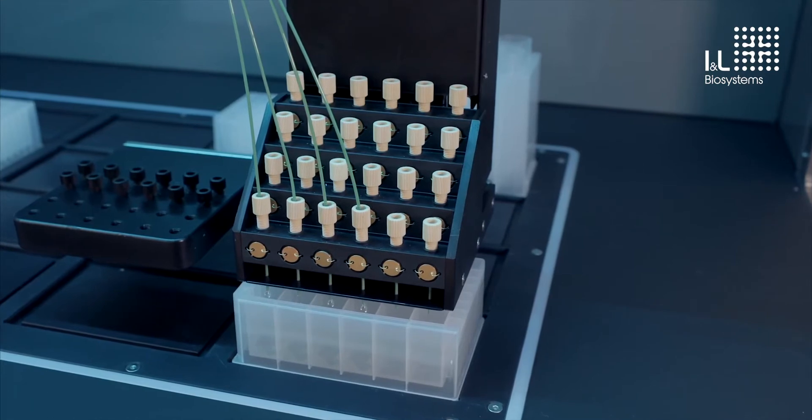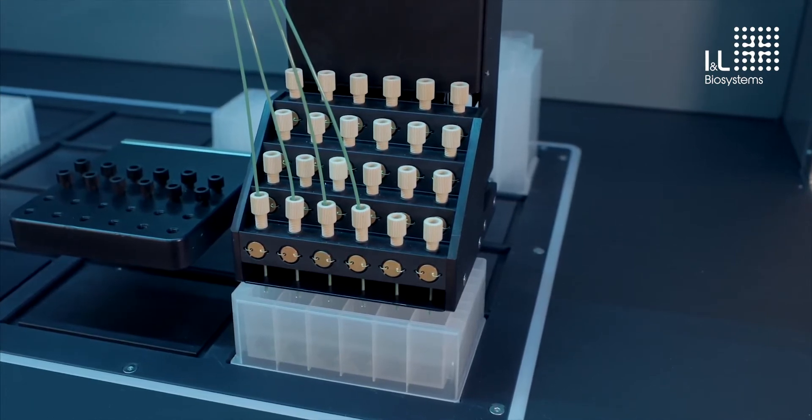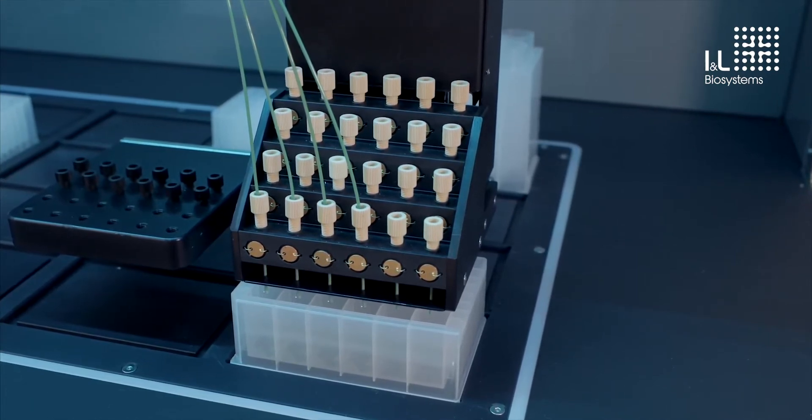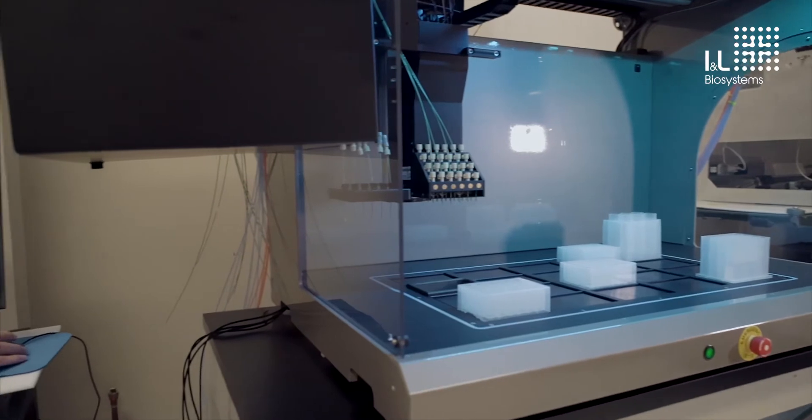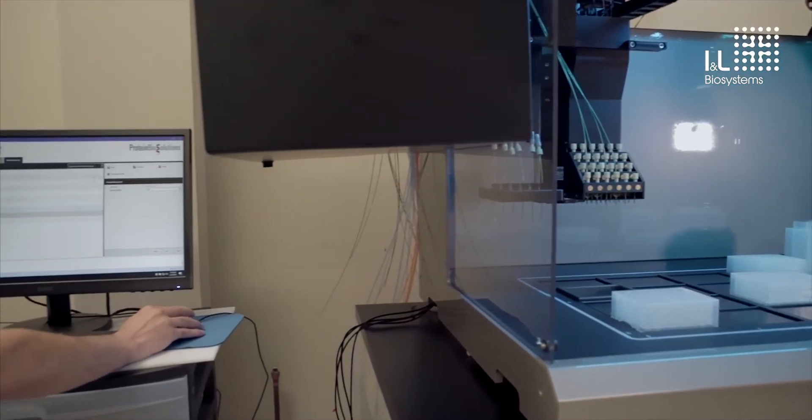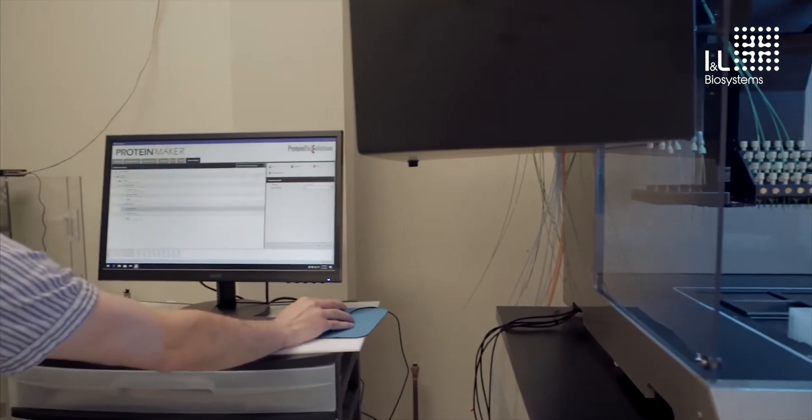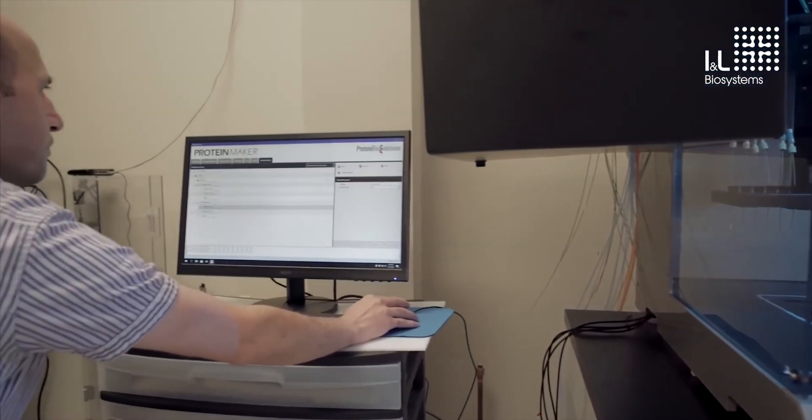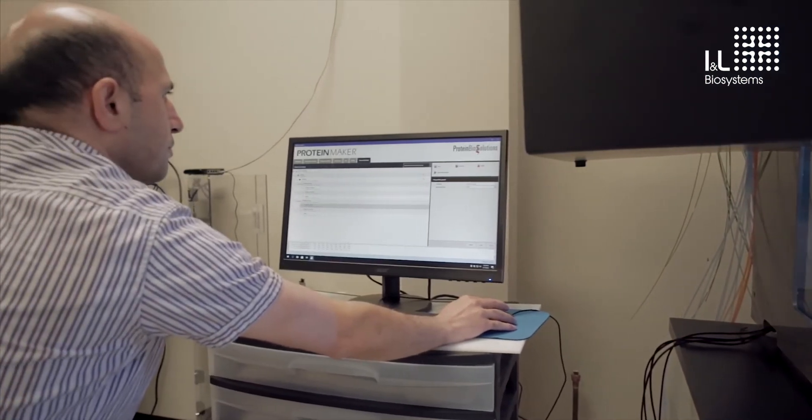The UV system is field upgradable, so it can be added to the system subsequent to the initial installation. The Protein Maker runs on dedicated software, designed to capitalize on the simplicity of the system while maintaining its inherent flexibility.